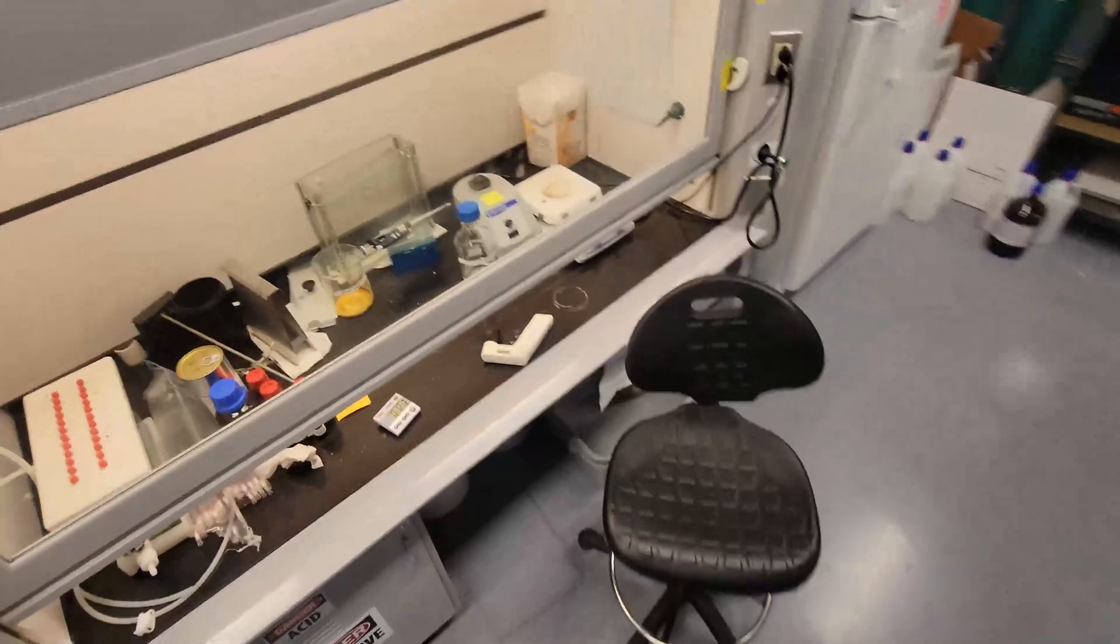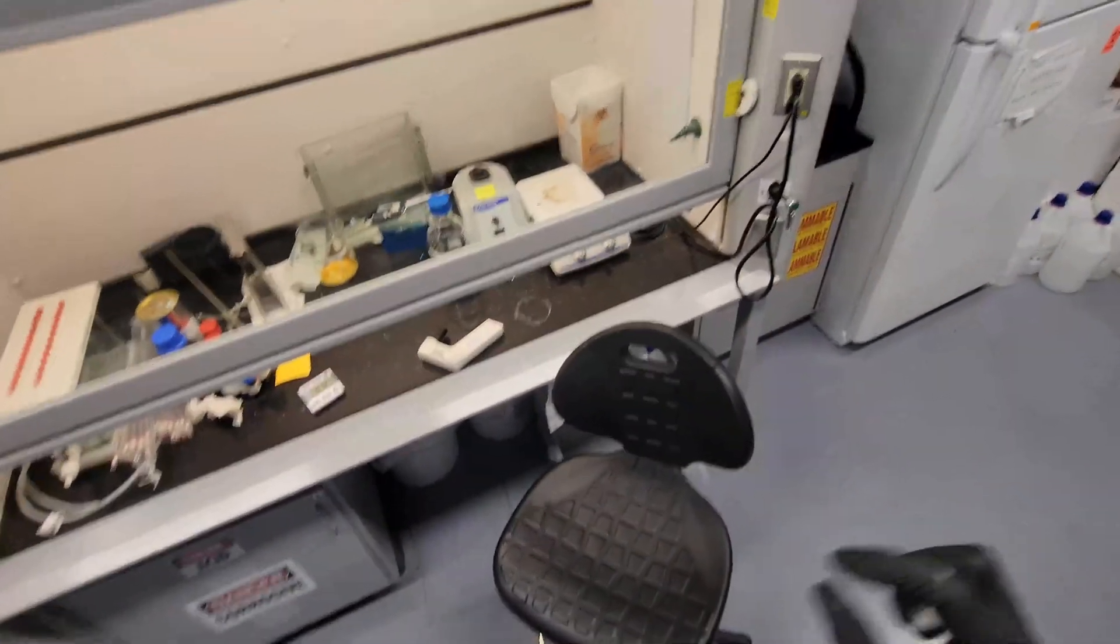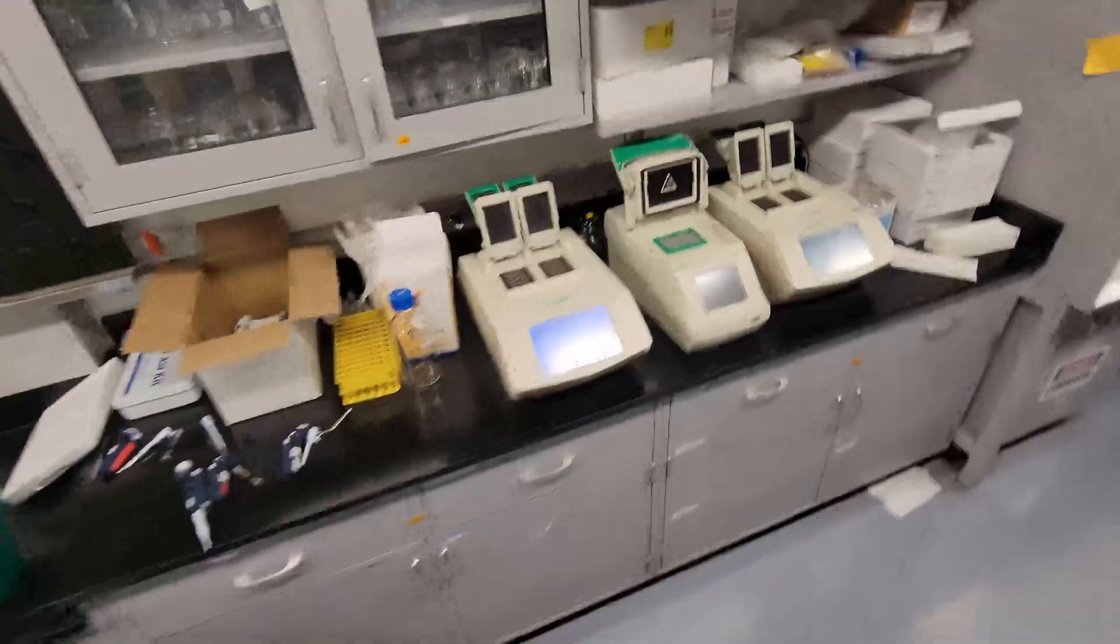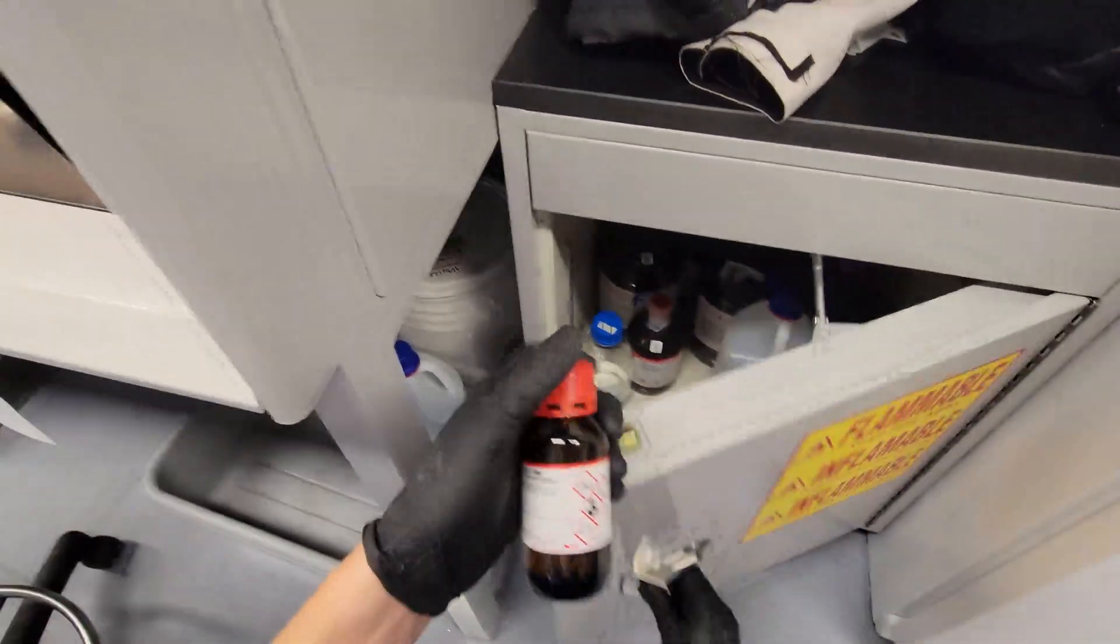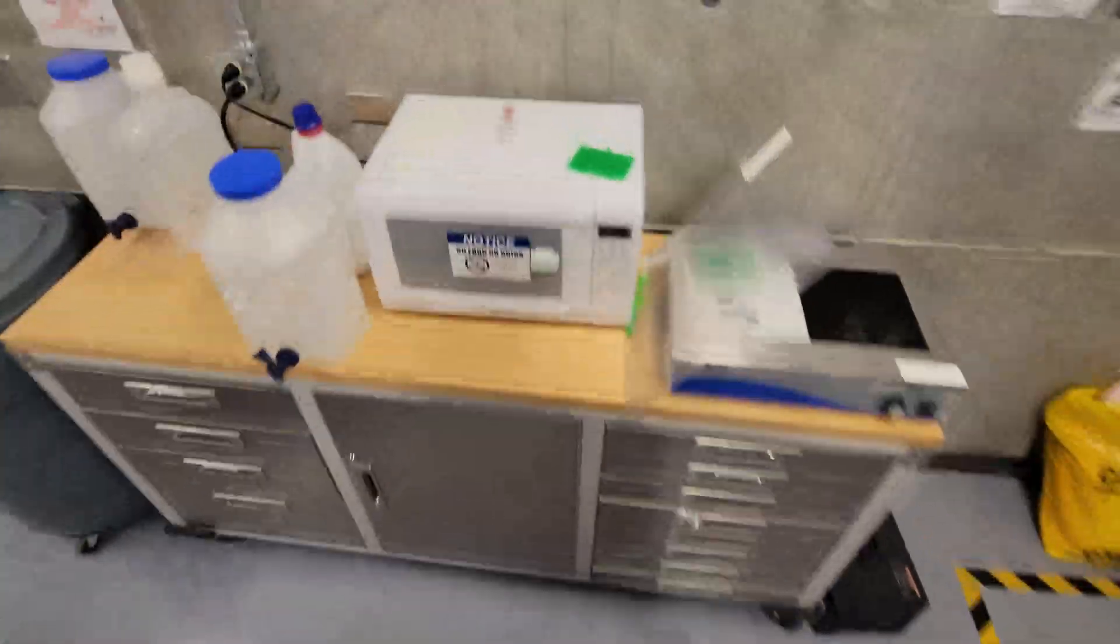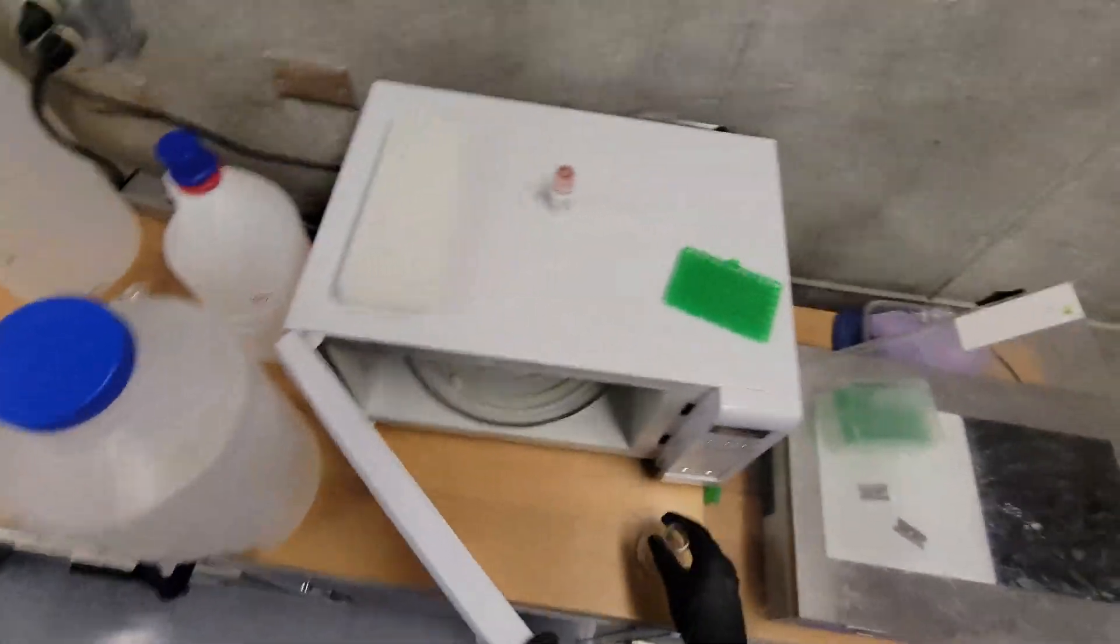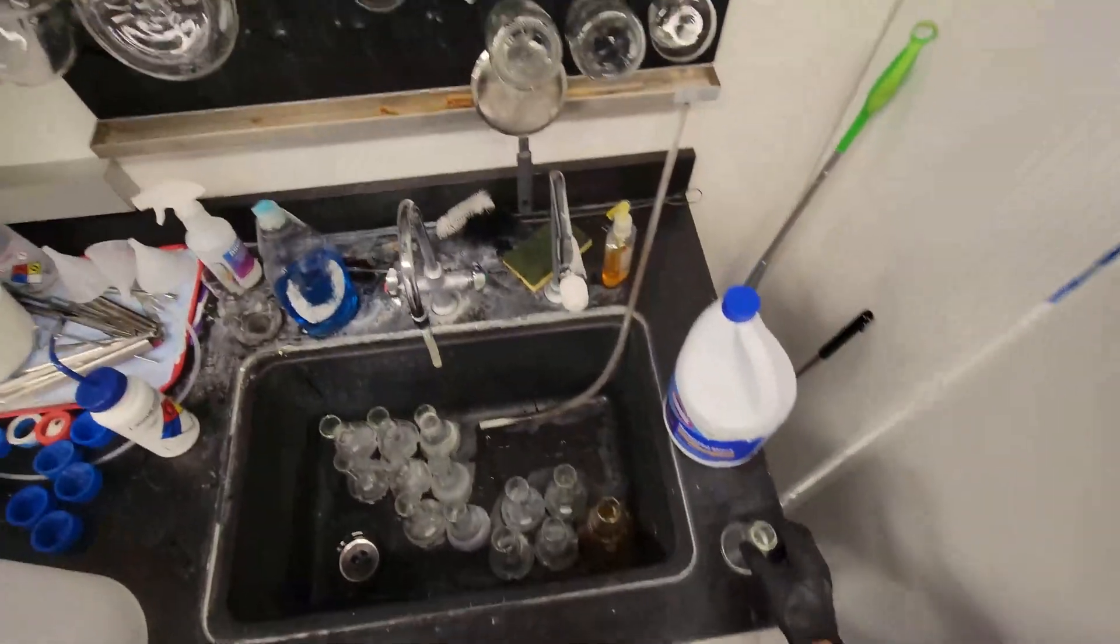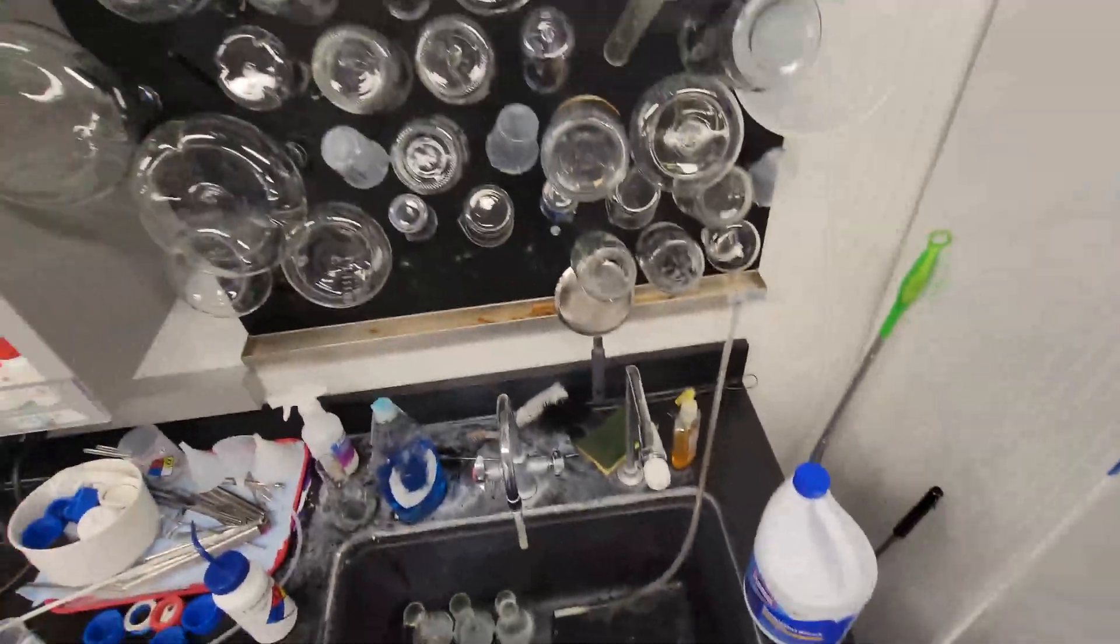So, this agarose solution is going to sit on top of our pellet, our little colonies of cells. And it's going to contain two chemicals: beta-mercaptoethanol, which we need to grab - two mercaptoethanol is the other name, abbreviated as BME. And the other chemical is going to be X-Gal. X-Gal is a sugar, technically. And we have to store it frozen or it'll break down. And it works in a weird solvent called NN-dimethylformamide. So, we'll be pulling that out of the cabinet in a second.